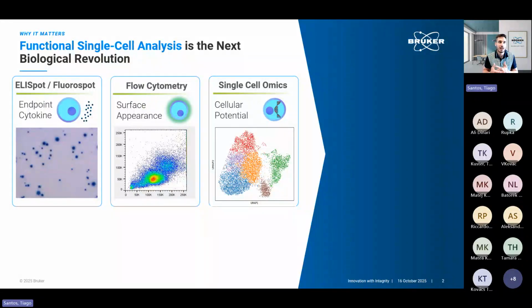Because in these types of projects, especially immune cell profiling, most researchers are really looking for depth of knowledge in terms of how the cell is responding, what cytokines it is secreting, what surface markers are on that cell, and also transcript-based data, to try to understand the response of that cell. The thing is, you have to split the sample in order to go to different platforms to do so. For example, you can use ELISpot to look at cytokines.